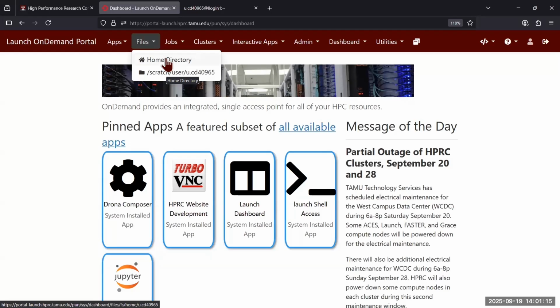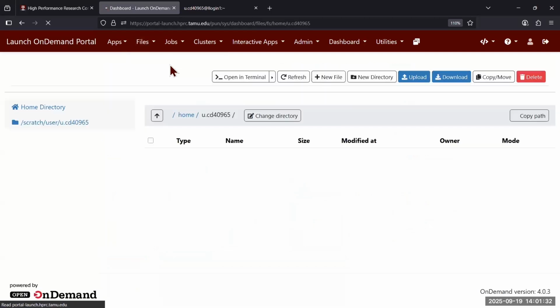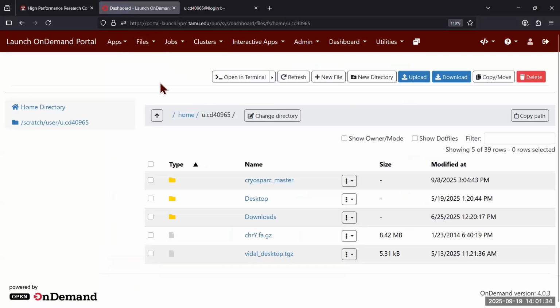You can still do this. We're not running jobs yet. Oh, you can't even log in. That's right. She's having trouble mapping. I don't know what that error is. Yeah, maybe it will. So you can close your incognito browser tab and then start a new one and try to go through it again. It might be ready now.